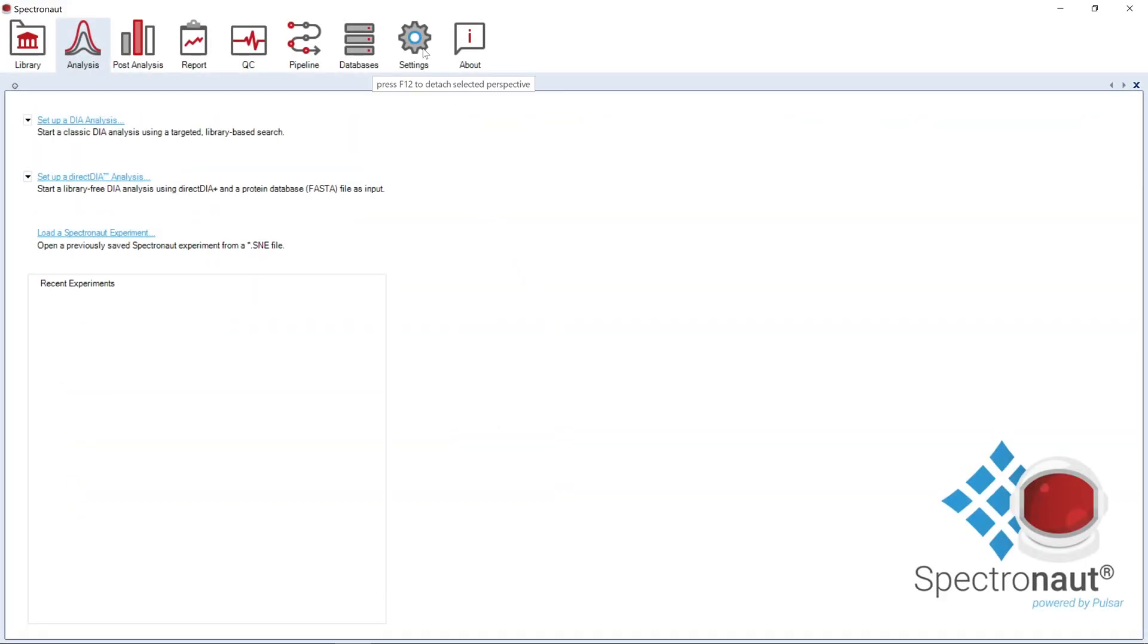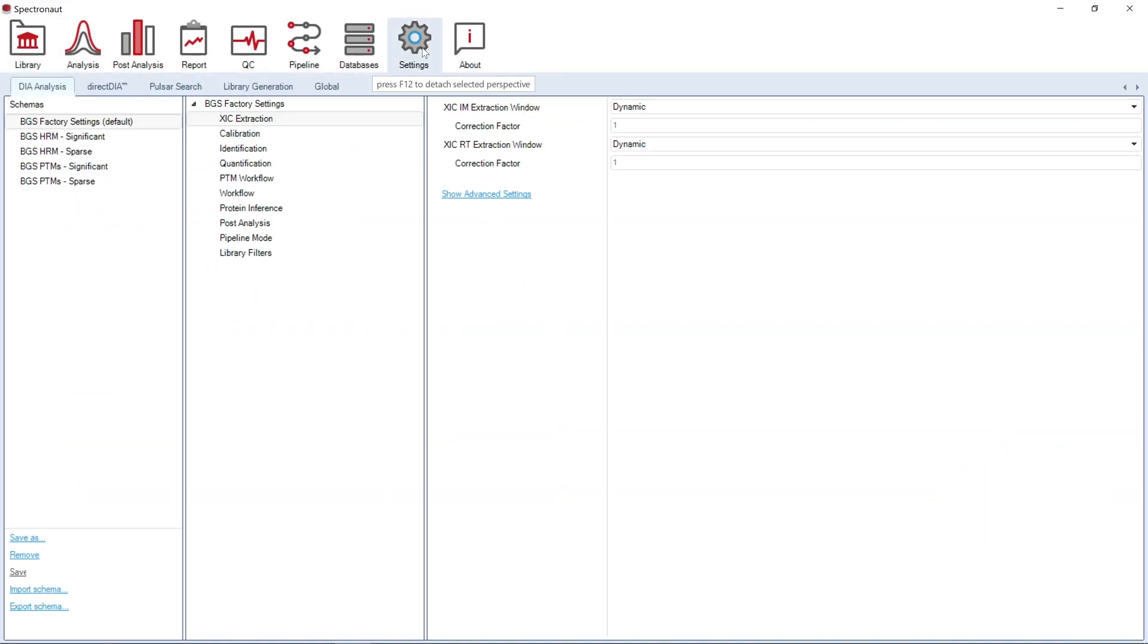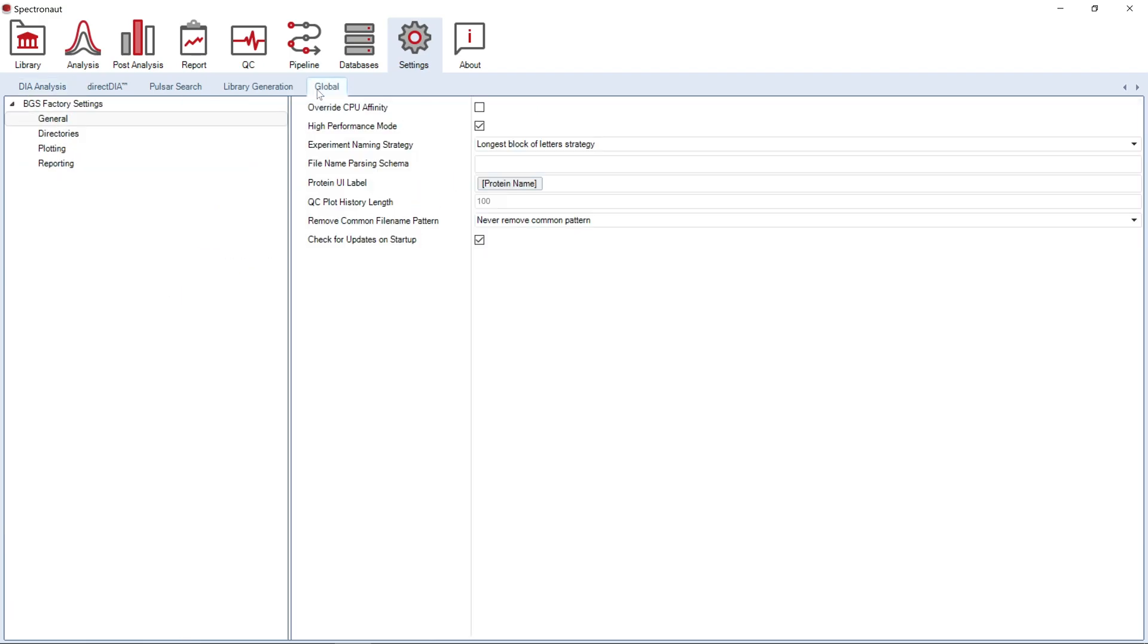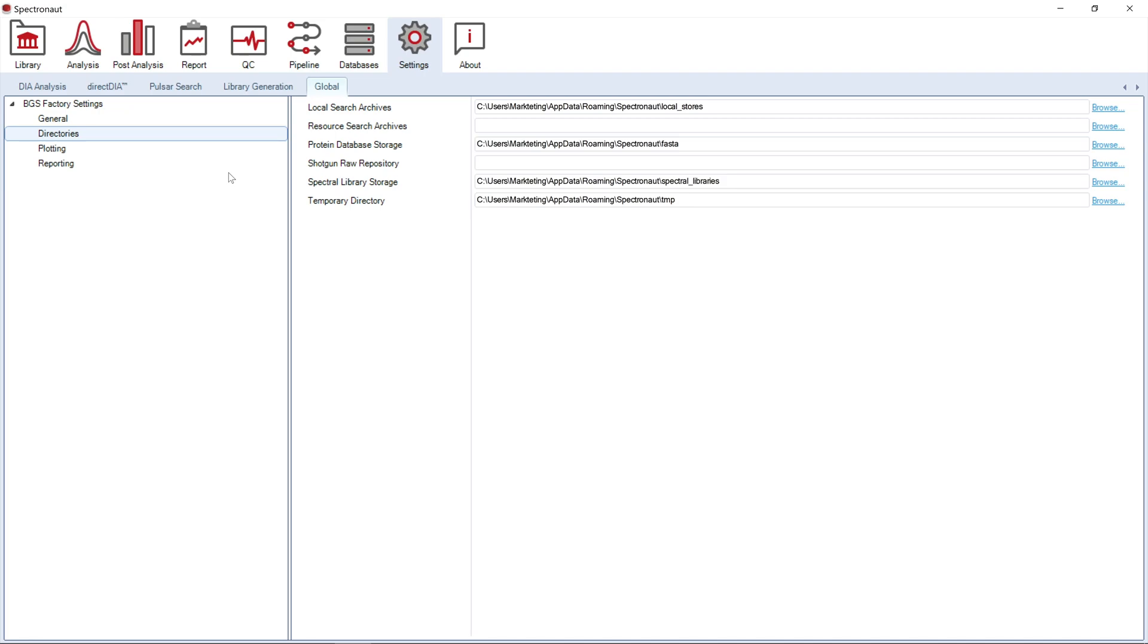Once Spectronaut is activated, you can change global settings to ensure optimal software performance. Spectronaut will set all directories in the C drive by default. However, it is likely that the C drive has a limited storage capacity.